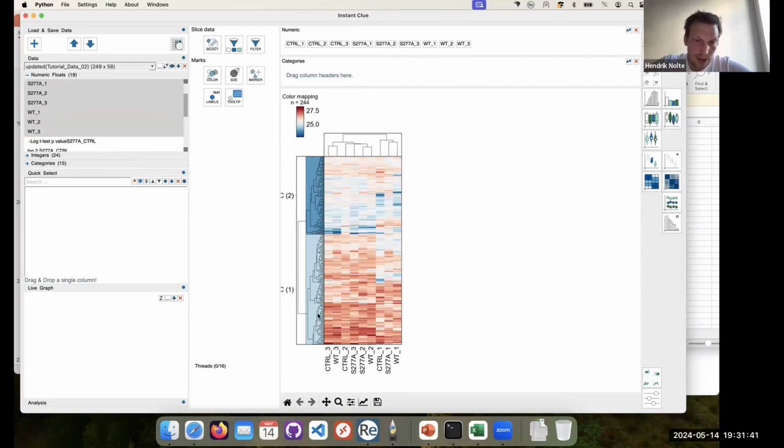And what you can see nicely here is the row dendrogram and here the column dendrogram. You can see in this case that we really have a difference between replicate 1 and the other 2 replicates. So this replicate 1 clusters away from the other replicates. But here we are looking at all the data, and in addition, we are looking at an IP. Nevertheless, let's go through the functions of this heat map.